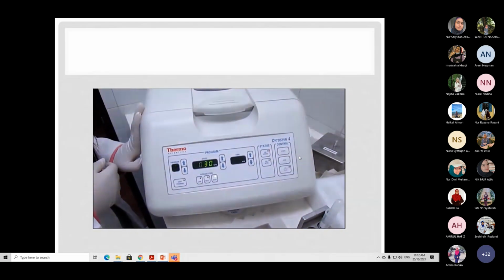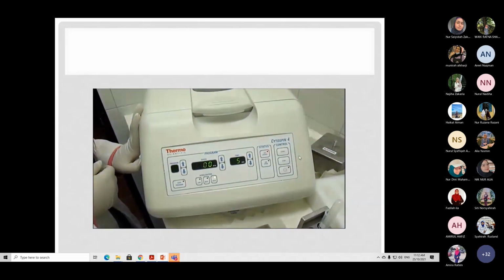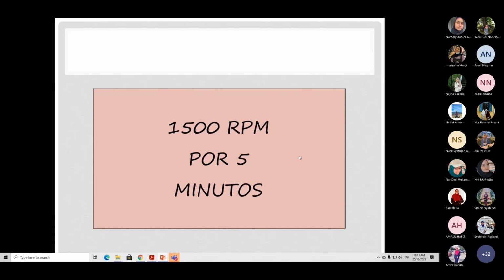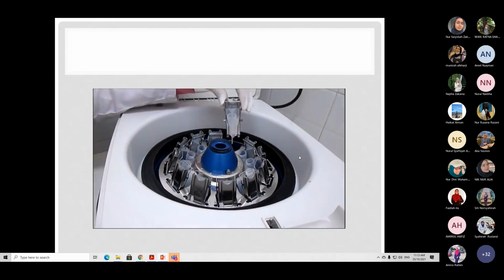So just now you see they put the fluid into the instrument, the chamber. After they spin this, the fluid will pull into the one area, and you can directly stain the slide after this.